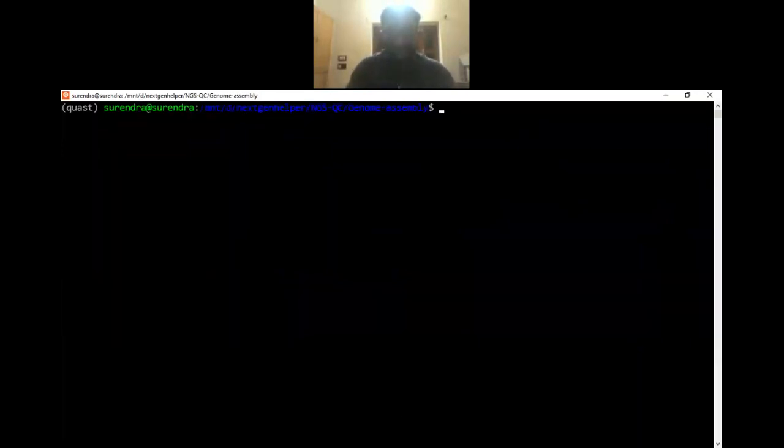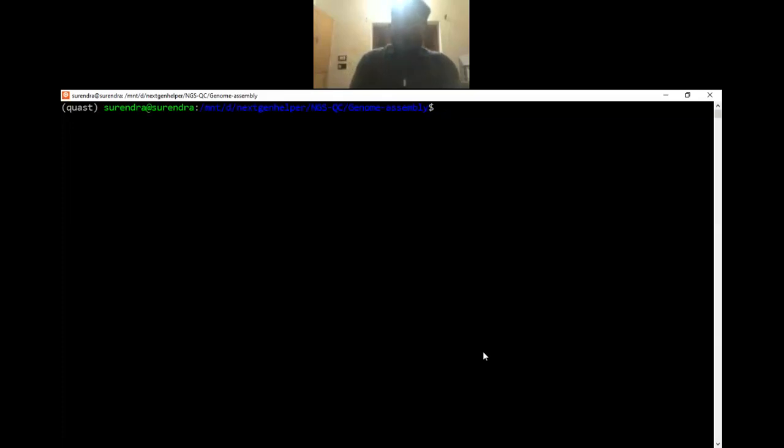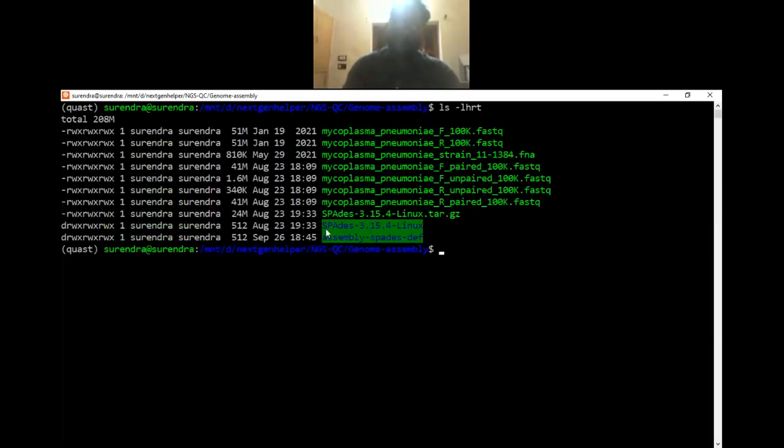I think the terminal is visible to you. Yes, sir. Okay. So we have SPAdes. As I showed you, I downloaded the version of SPAdes 3.15.4, the latest version, here in this current directory. You can download it anywhere.